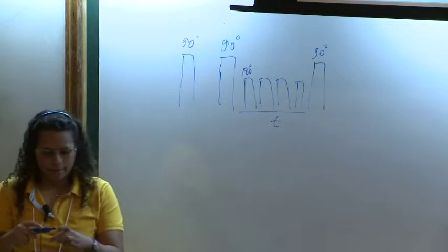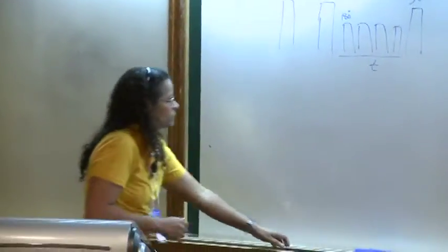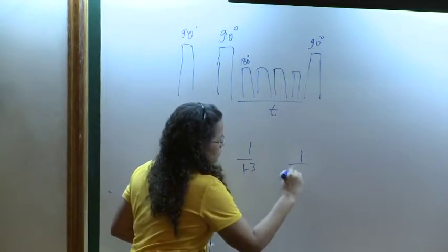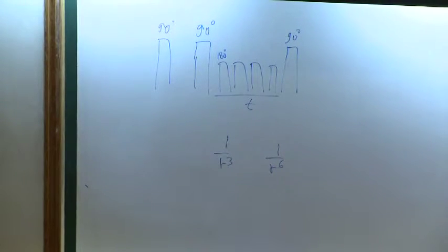You can make the recoupling really fast, and you can get the signal faster than NOE, because the dipolar coupling is 1/r^3, and NOE is 1/r^6, so this is the reason. You can get your results faster.